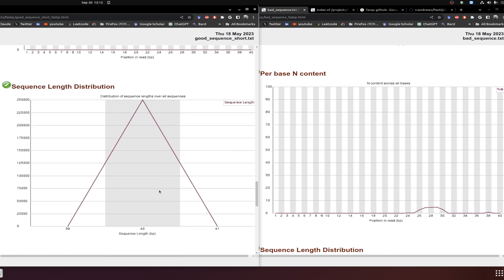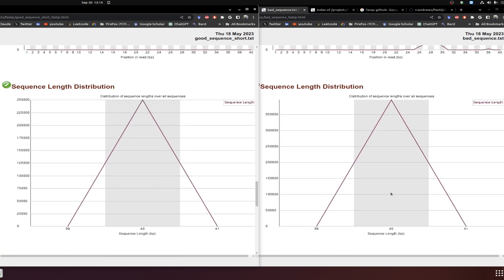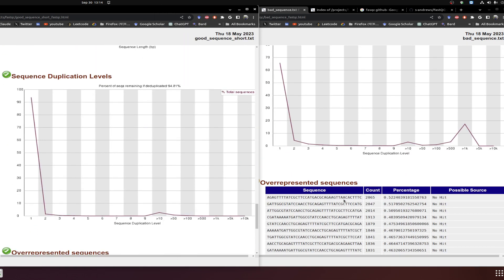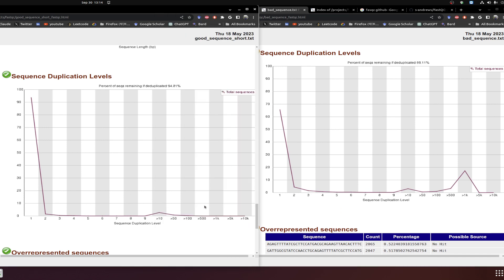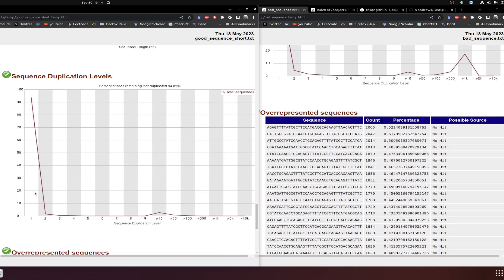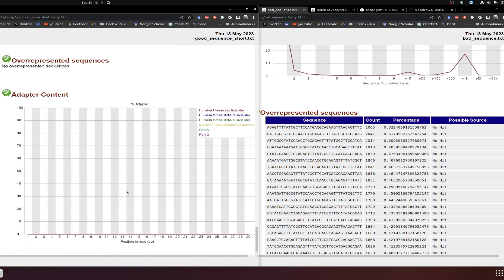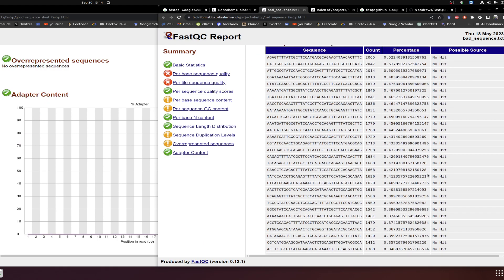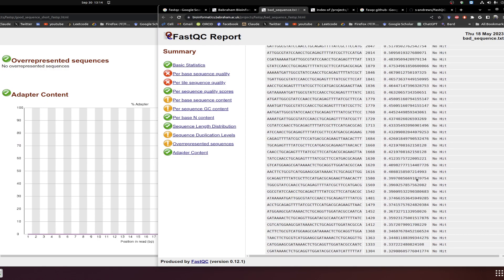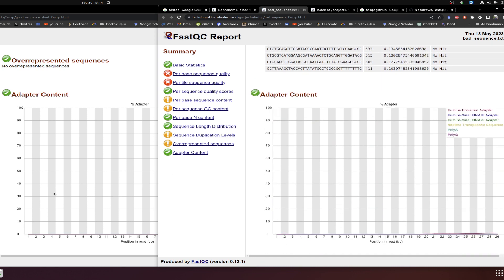Per-base N content indicates ambiguous bases, which signal poor quality. Sequence length distribution shows fragment sizes — an abnormal distribution would be a concern, though it looks fine in both examples. Sequence duplication level is an important metric that indicates if there is high duplication anywhere. The overrepresented sequences module is also very important — if there are overrepresented sequences, it could indicate issues like contamination or adapter carryover.